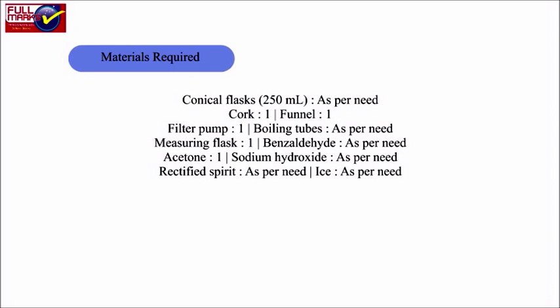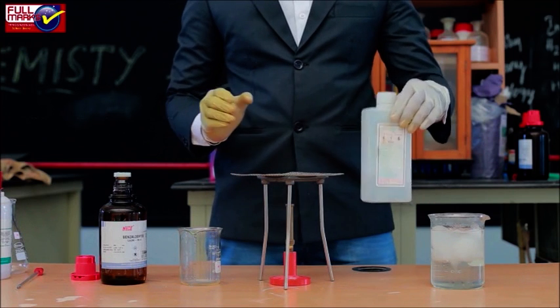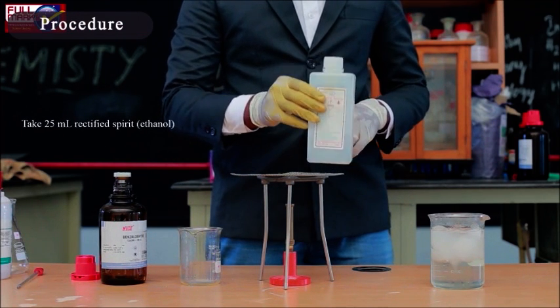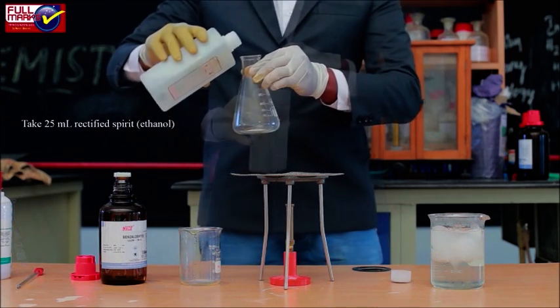Procedure: Take 25 ml rectified spirit, that is ethanol, in a conical flask.